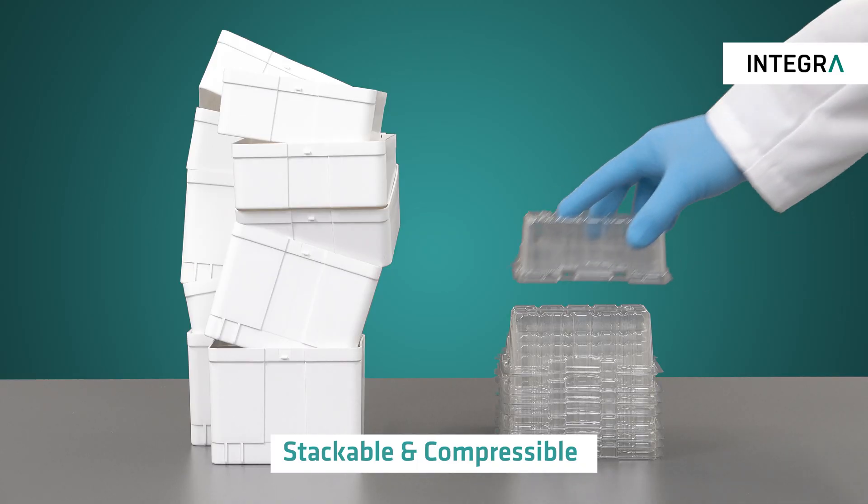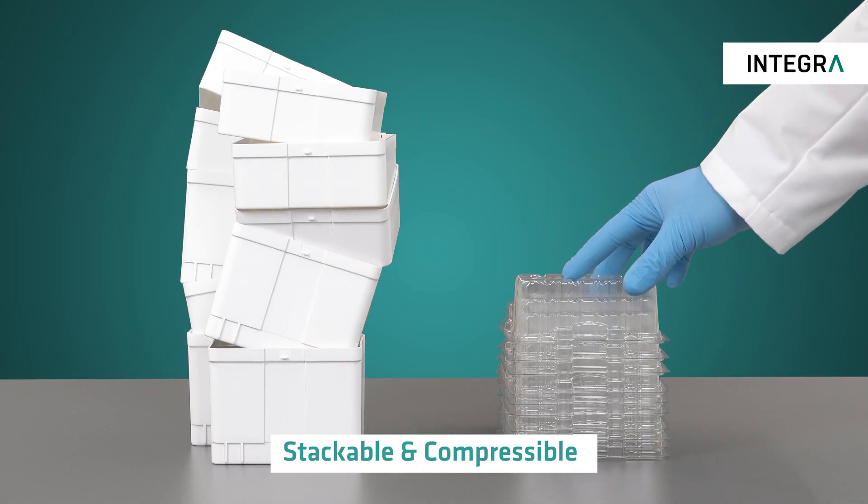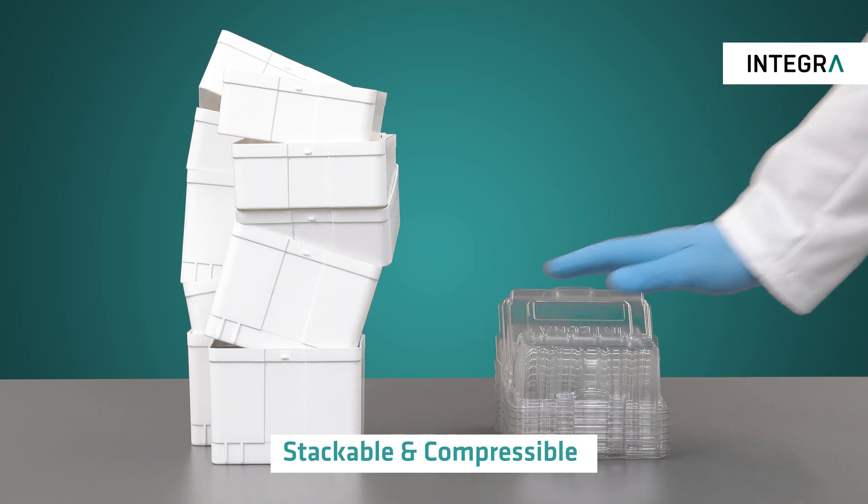Once empty, Eco-Racks can be stacked and compressed in order to minimize the space needed in your recycling bin.